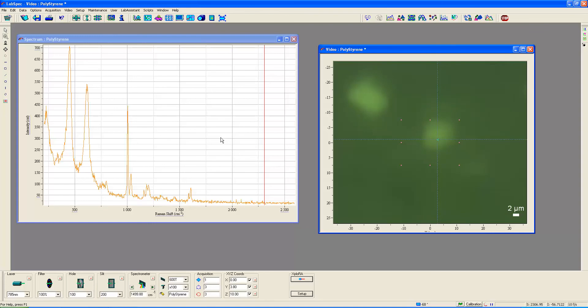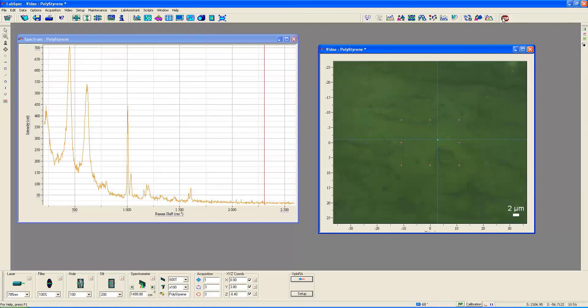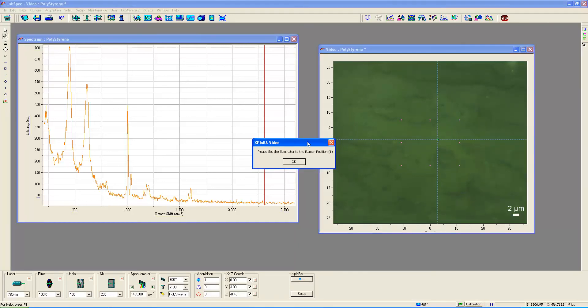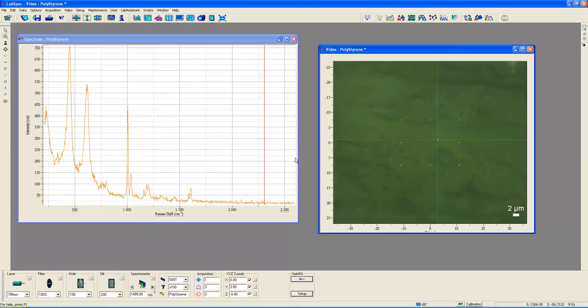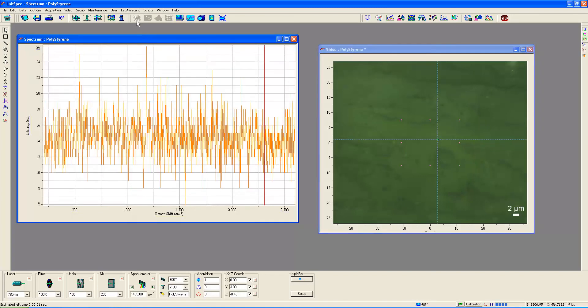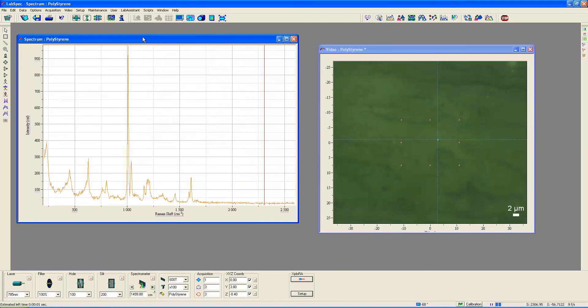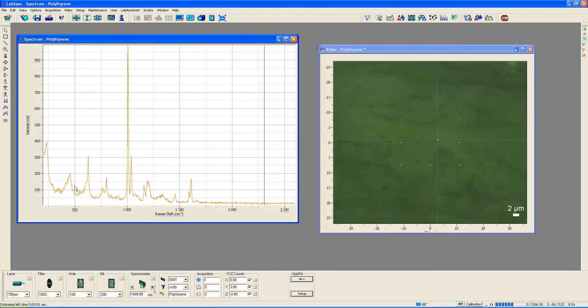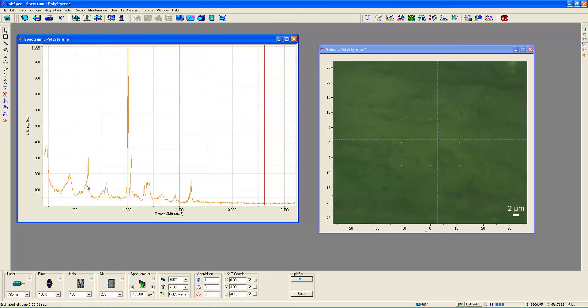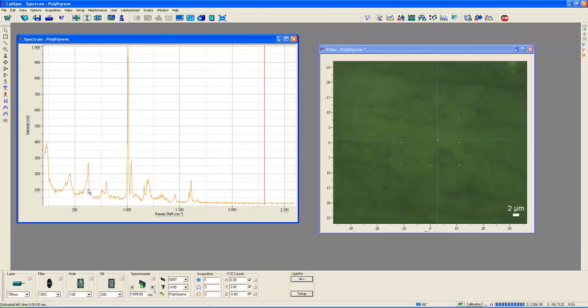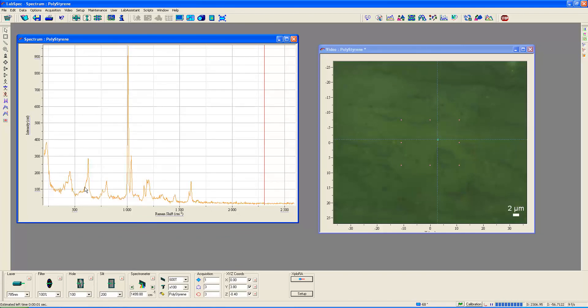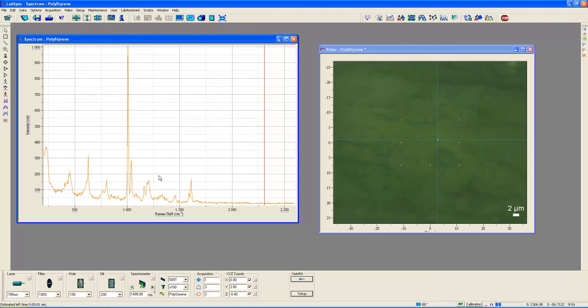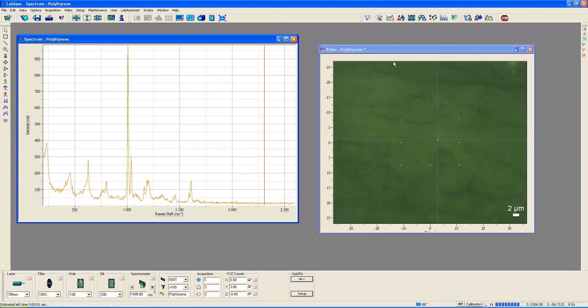And now we're in the video mode. And I'm going to bring this back to the surface. So now we're focused right back on the surface of this polystyrene. And I'm going to stop the video. We'll set the turret back to position one for collecting the Raman spectra. Go back to real-time display. And sure enough, there's our polystyrene without really... there's just a hint of the titanium dioxide underneath there.